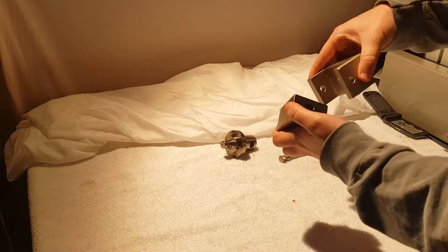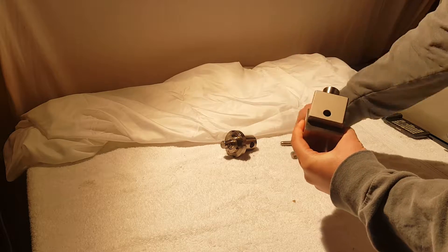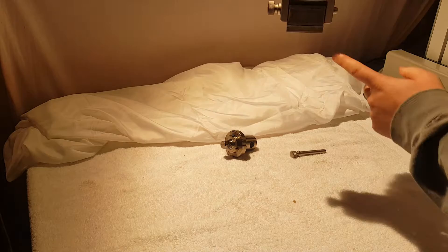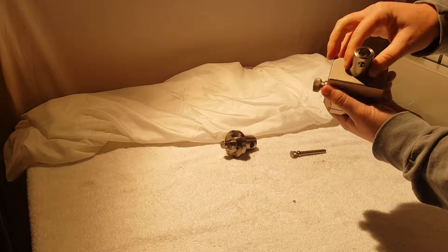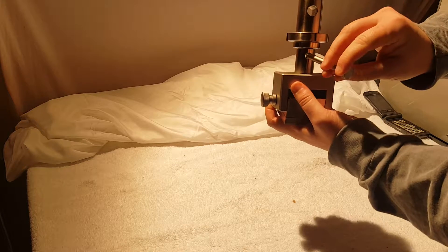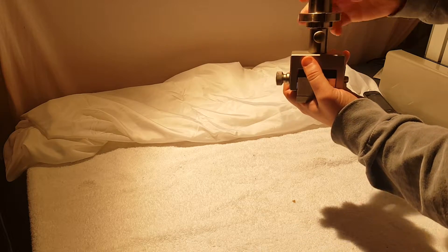Once the sample is adhered to the block, we go ahead and put it into our fixture with the locking pin here. The fixture hangs off the machine like this. This has a female 5/8 inch adapter, so if we were going to go into an inch and a quarter on the machine, this is how we would do it.